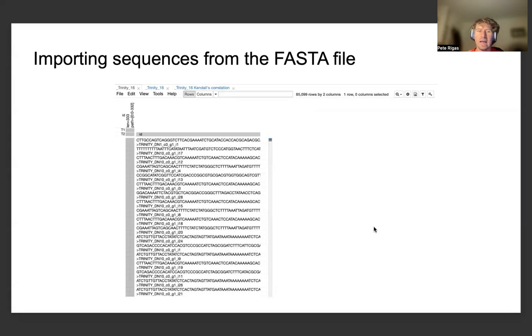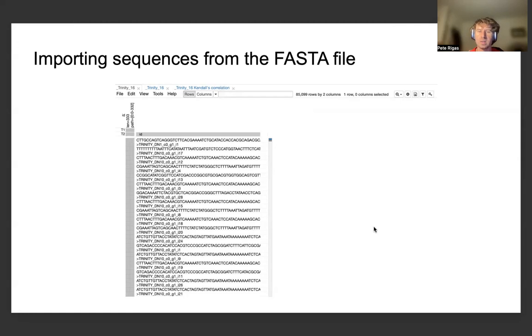It's much more convenient to have this interface to load the FASTA file with however many genetic sequences are produced by the transcriptome assembly or from different bioinformatic pipelines, and to make use of the functionalities of Morpheus, which we'll be describing further in the upcoming slides.